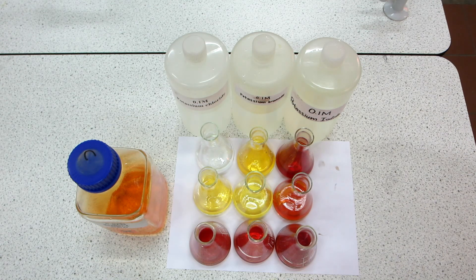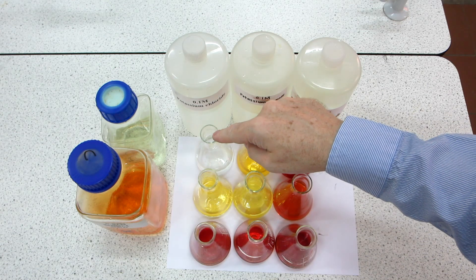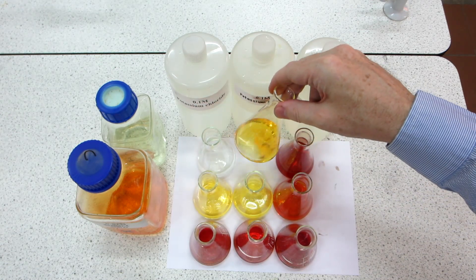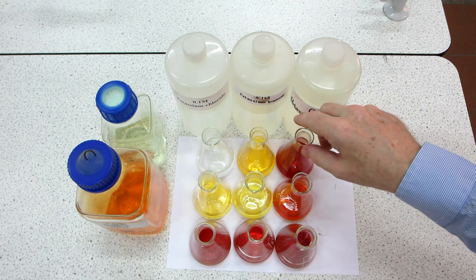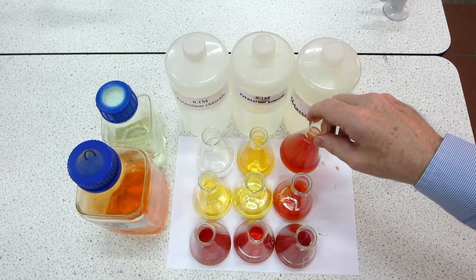Once again you can see a difference in the intensity of the colors. Chlorine into potassium chloride shows no noticeable change, but chlorine into potassium bromide gives a development of an orange-yellow color, and into the potassium iodide we've got that familiar iodine color present.